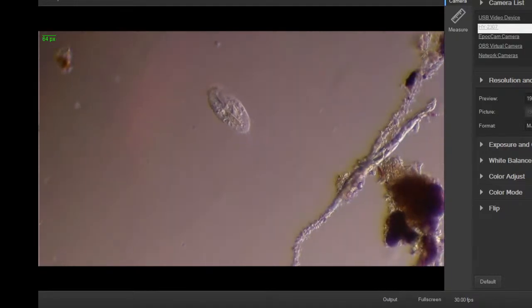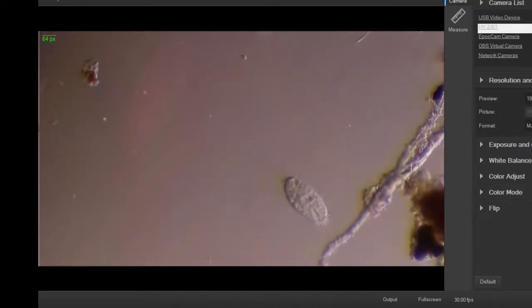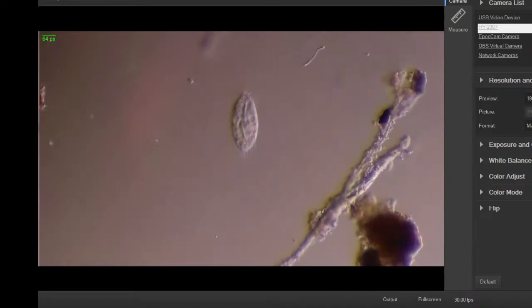And this is not even a good camera. I'm actually getting a better camera pretty soon. This is just a basic USB microscope camera from China. The clarity is pretty good, but it's got too much stuff set to auto. You can't really manually control it that much. The exposure is, as you can see, every time I tweak it a bunch, it auto exposes everything and there's no way to turn it off.